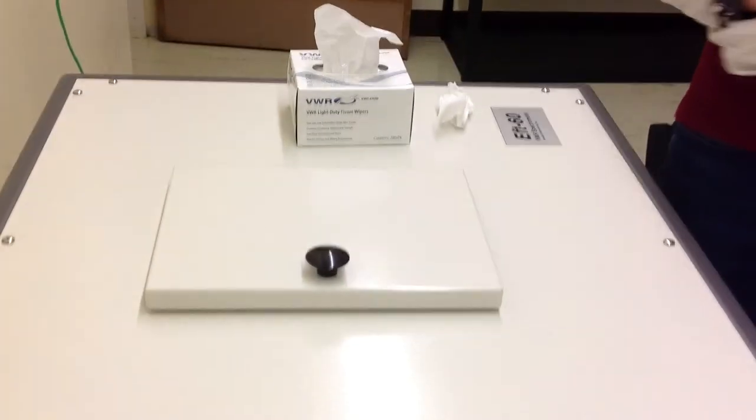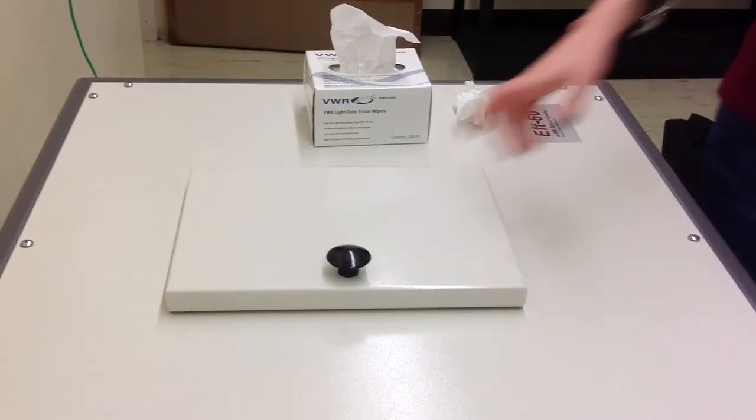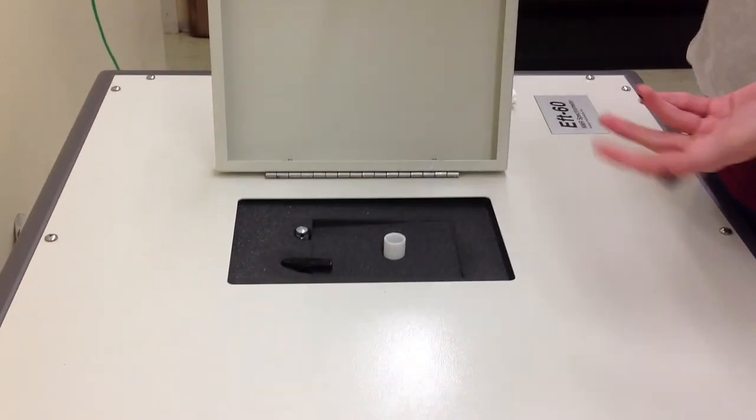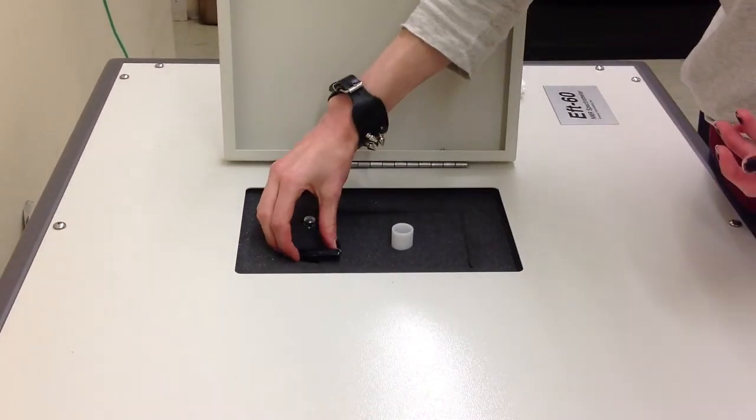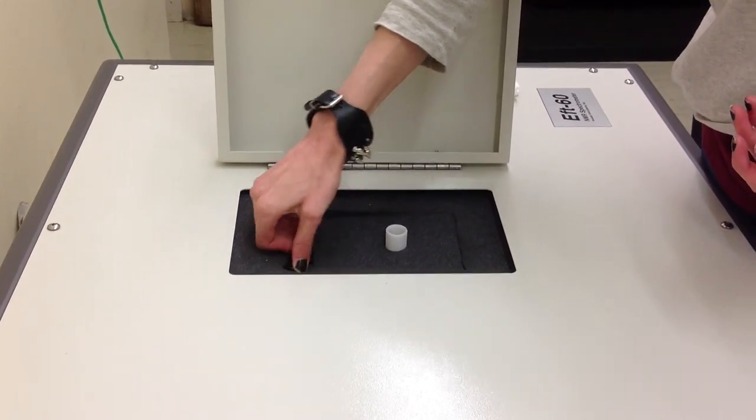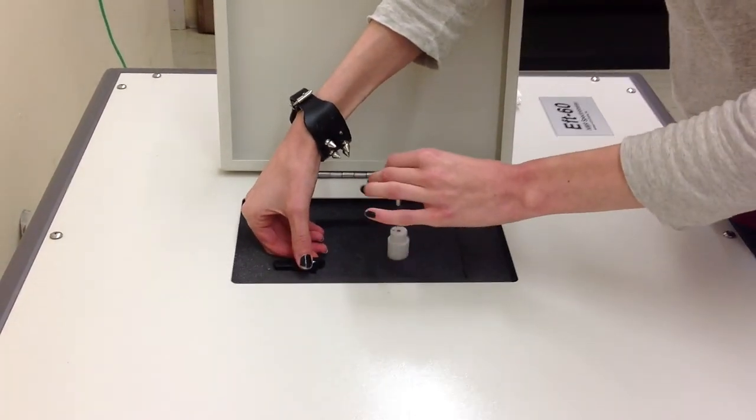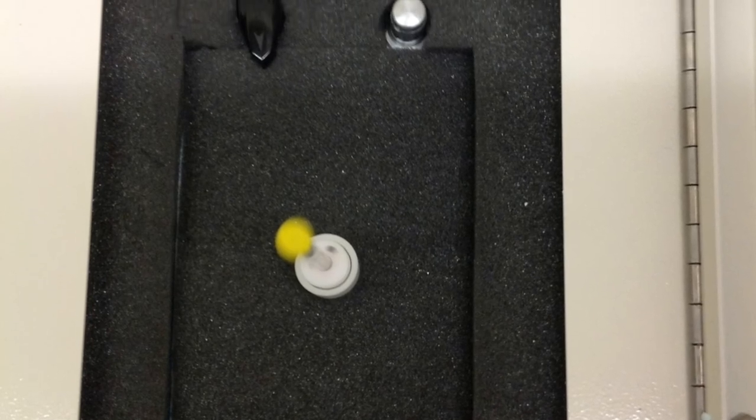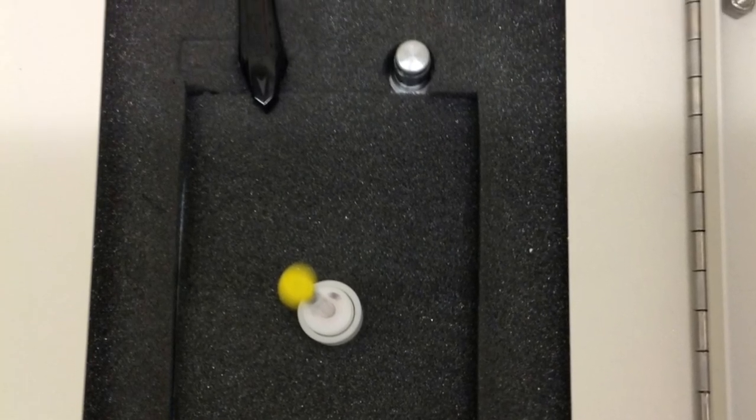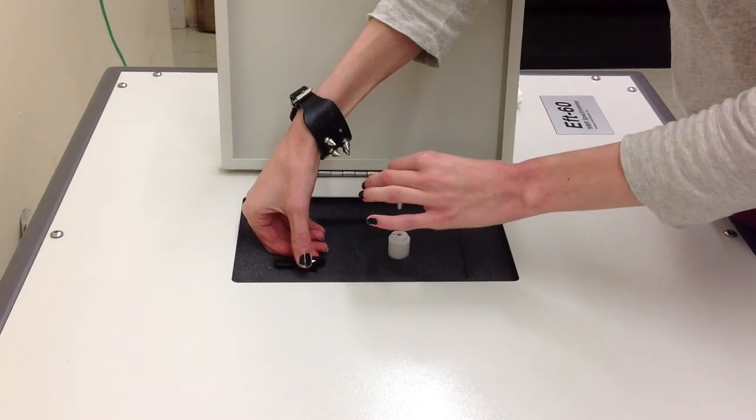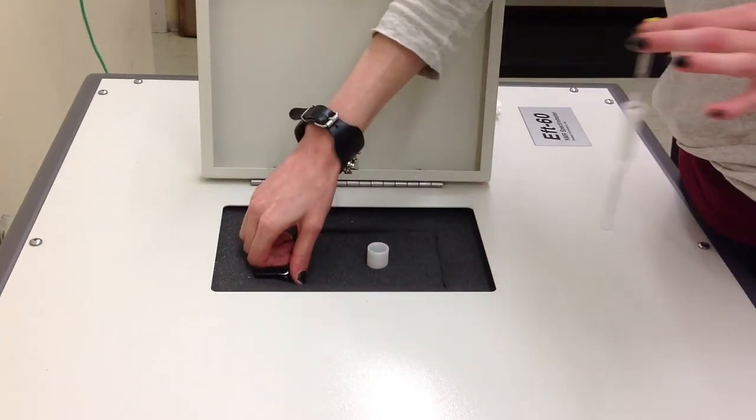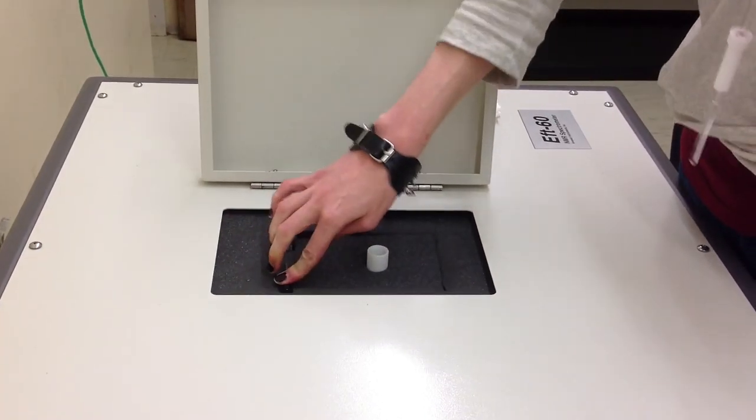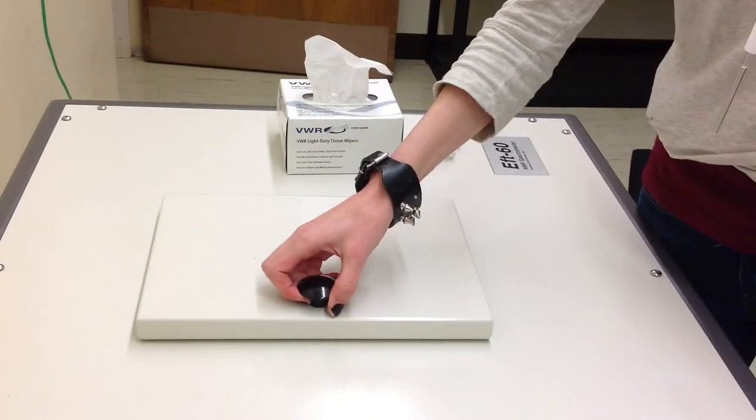Now I'm going to show you how to remove it from the compartment. You open up the compartment door, and all you have to do is turn the dial up, and your tube will come straight up, and you can remove it. Turn the dial back to halfway, and then close the compartment door.